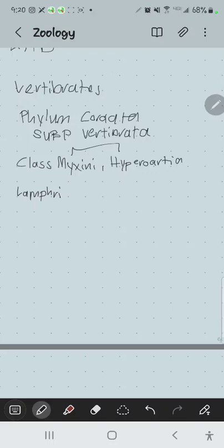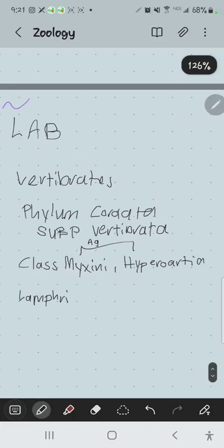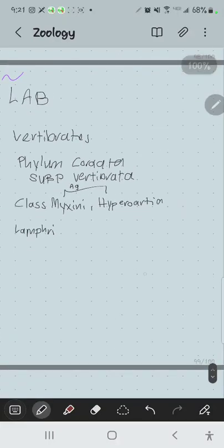Okay, and then they had specifically 7 gill arches. 1, 2, 3, 4, 5, 6, 7 gill arches. Okay, and that's kind of how they were set up. Basically, the gill arches were for respiration and, in the larval stage anyway, feeding. They use the gill arches for filter feeding. But we have these 7 gill arches suspended off the bottom of the brain.